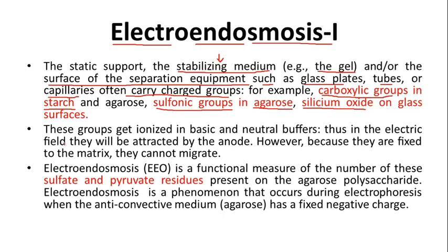These groups get ionized when we place the gel into the buffer, either basic or neutral buffer.